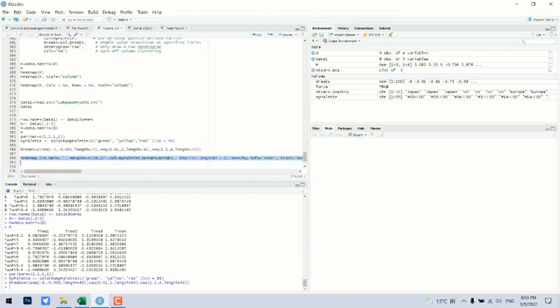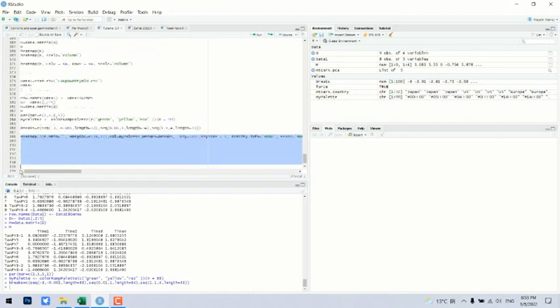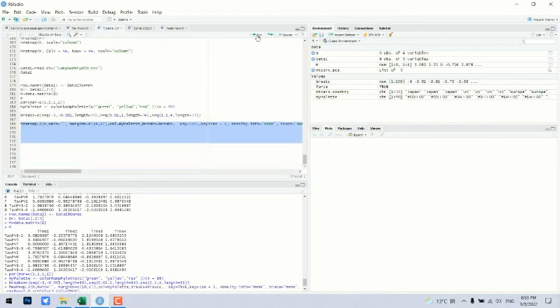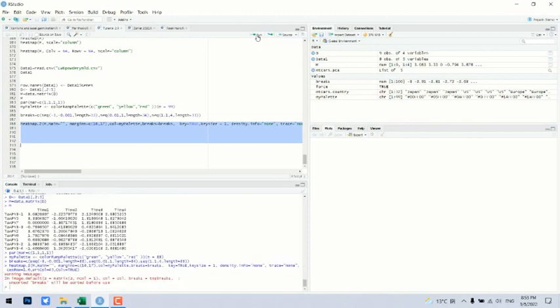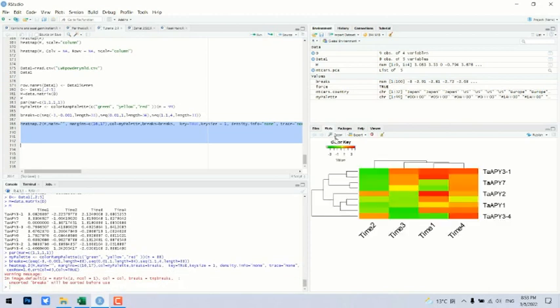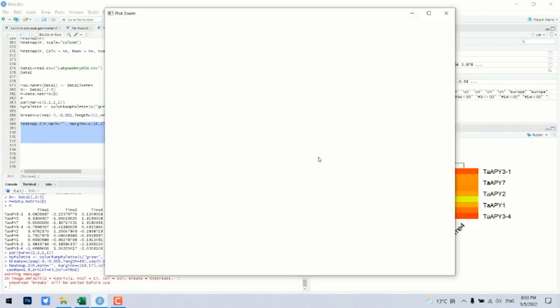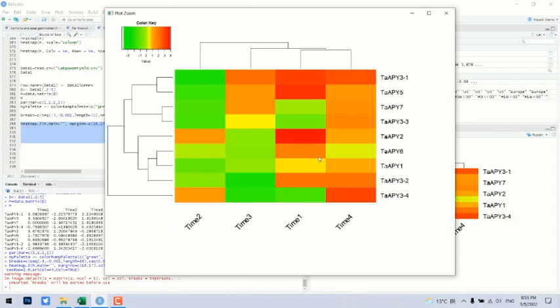And now we can run our final command. And here we are. This is a beautiful heatmap.